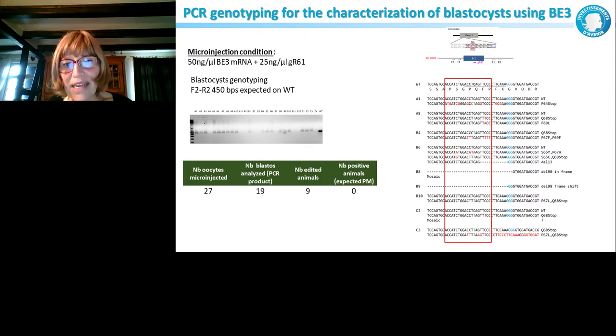And when we analyze these animals, you can see clearly that it's really surprising, because I put the correct, expected modification in green, and all the other modifications in red. And that is definitely not very specific. It's a little frightening to see that, and I wouldn't trust that to do genetic therapy. But that's the base editor 3 version.